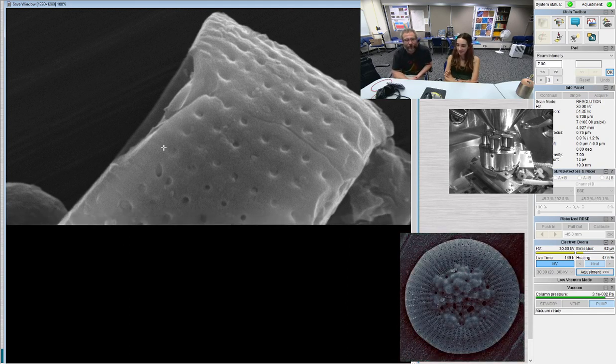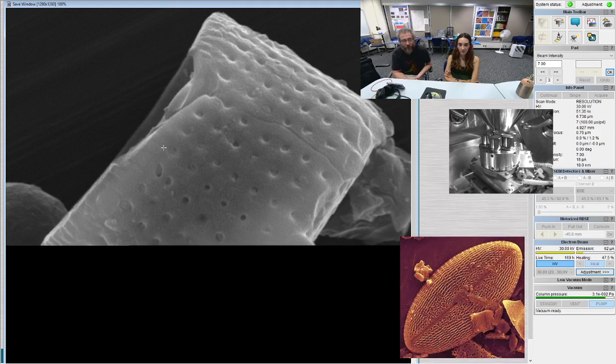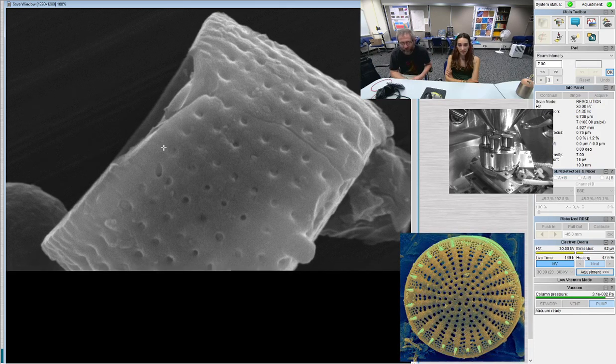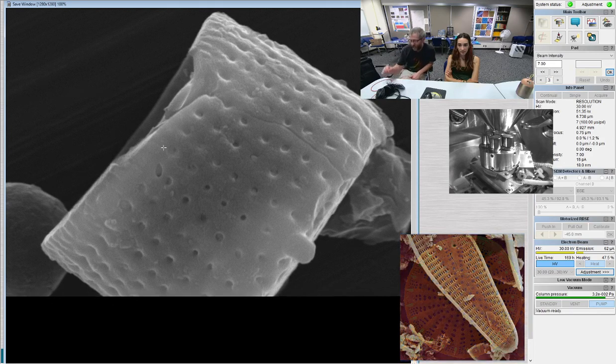But if I'm going to send them off to a museum because we're collecting something as a specimen, I probably would find a way to mark where it was on the slide. Or I could mark where zero is on the side. Like I could put a vertical line where north would be or whatever. And then when I put it back in, I could put it back in at that position on that particular carousel number. And I probably could get it close enough that I could find it again.